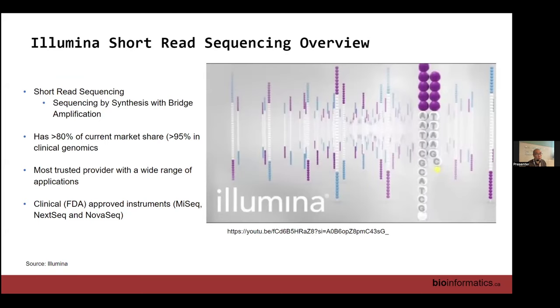So first one, Illumina. I'm going to let you guys watch a video, and that will give you a sense of how this technology goes.